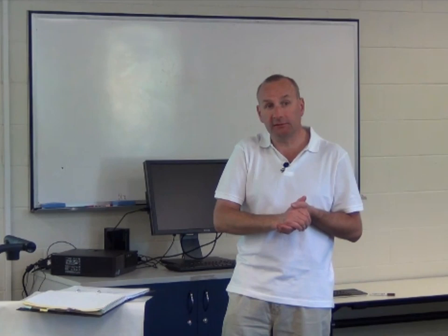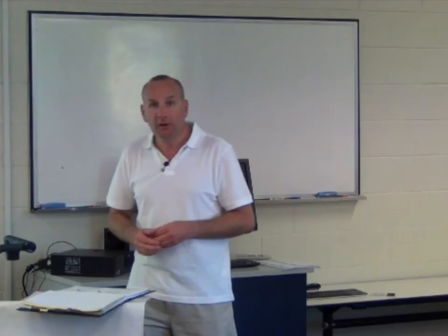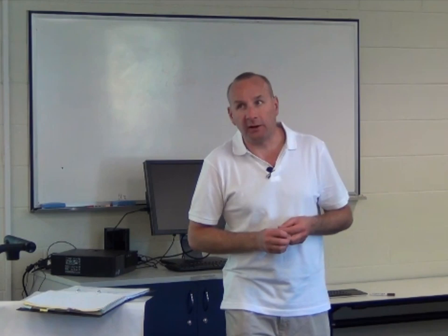And this is an example of a difference experiment. We came across this when we were talking about INEPT. We talked about suppressing an unwanted signal. And it's also an example of a simple phase cycle. So this is what you would do in this experiment to suppress these unwanted signals. When we talk about coherence selection, we'll see a more formal way of describing that. So that's the first of our heteronuclear experiments, the HSQC experiment.